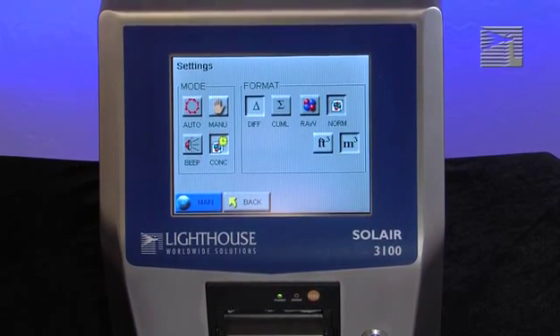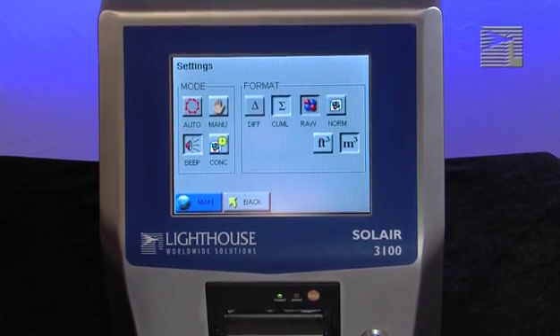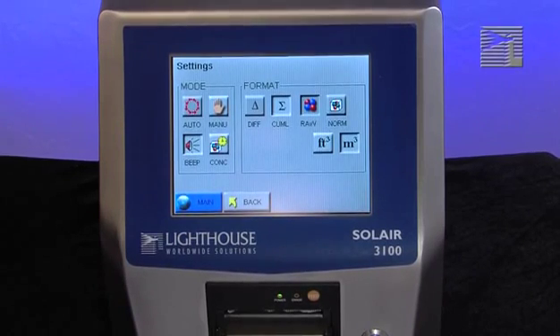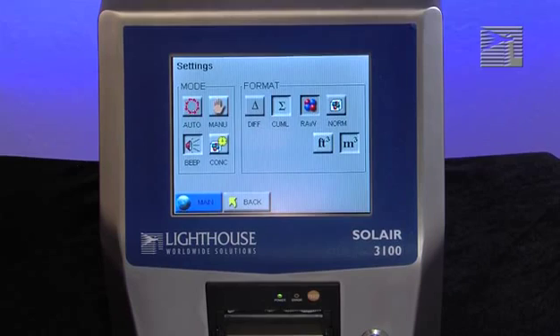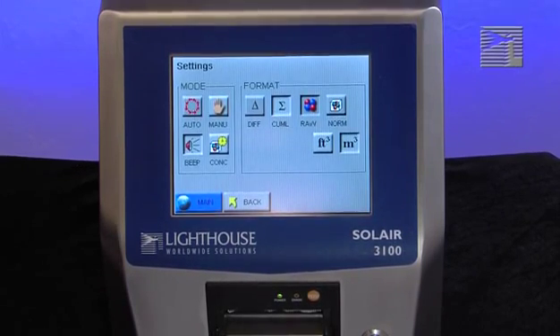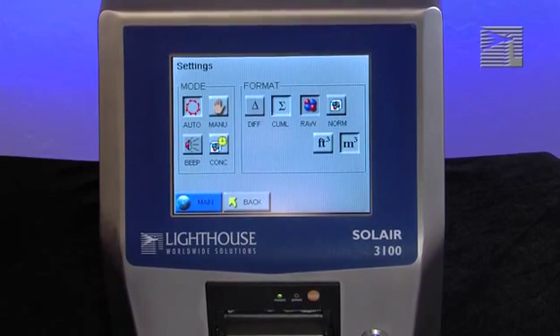When the instrument is in Beep mode, the instrument is pre-configured to beep according to the alarm threshold set in the alarm configuration. The instrument will beep each time an alarm threshold is reached and then every multiple of the alarm limit. Select the mode of operation you want to use and move to the next set of buttons.